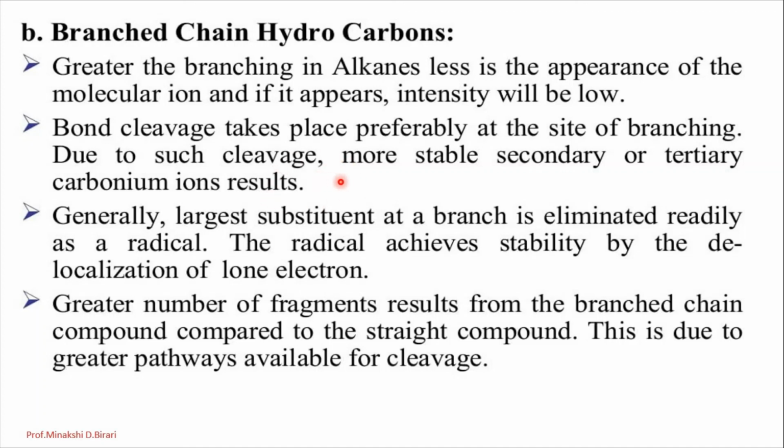Next, generally the largest substituent at a branch is eliminated readily as a radical, and the radical achieves stability by delocalization of the lone electron. If we consider different examples, we find that the largest substituent at a branch is eliminated readily as a radical. Next, a greater number of fragments results from a branched chain compound compared to straight chain compounds. This is due to the greater pathways available for cleavage.